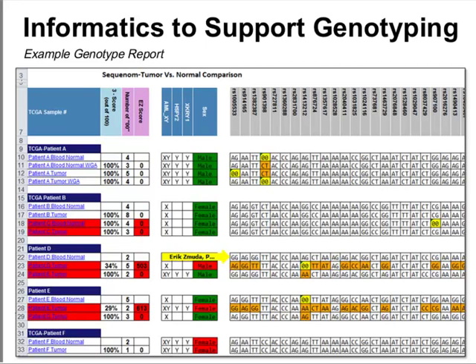Easy score value of 1, and then anytime there were heterozygous mismatches, we put that as an easy score value of 100, and then you sum those across the row so that you can just immediately know this patient has 5 homozygous mismatches and 3 heterozygous mismatches. And it gives you some extent of the degree of difference between the genotype of the tumor and the normal, or any two samples relative to the blood normal. There's a way to get rid of that flag.